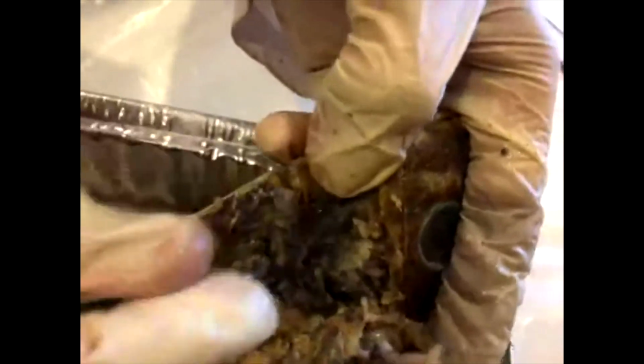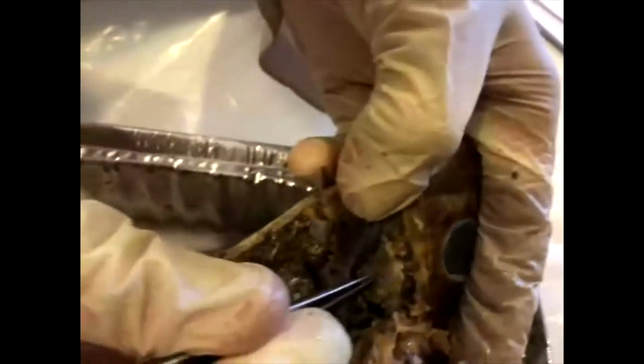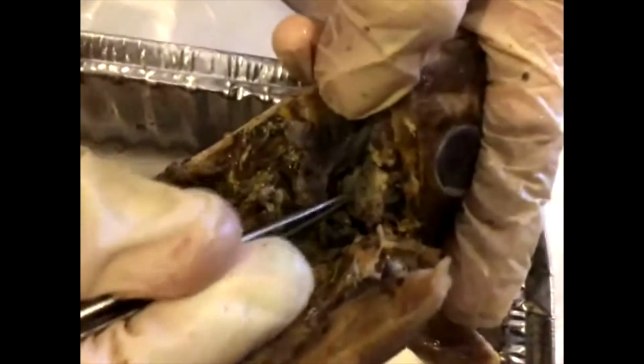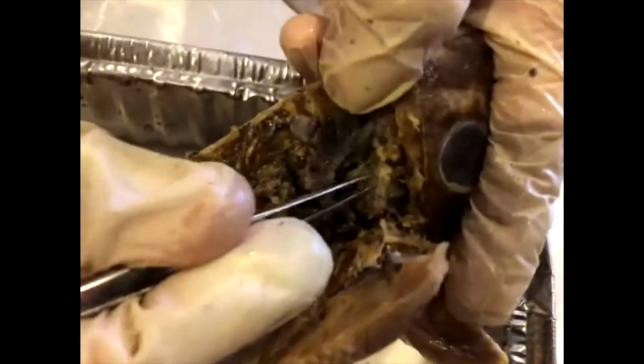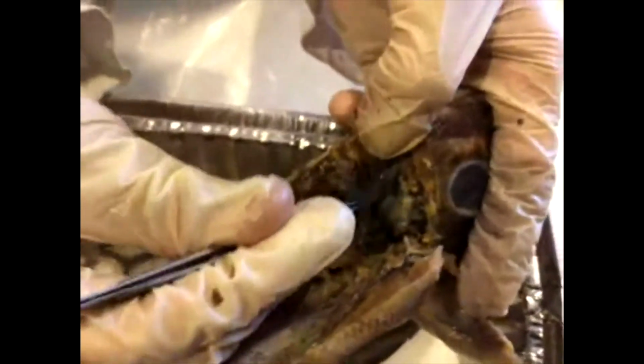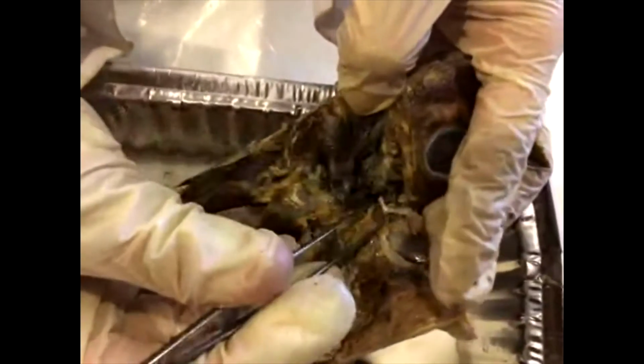It has an atrium where deoxygenated blood goes in. And then once the blood's in there, it's getting oxygenated. And then it leaves through the ventricle, which is this lobe over here. And this ventricle is really, really muscular. It doesn't really give much when I press on it. And the reason why is because the oxygenated blood leaves the ventricle and goes to the rest of the body. So this is where the big squeeze is happening that pushes that blood and pumps it around. So we've got the ventricle right here.